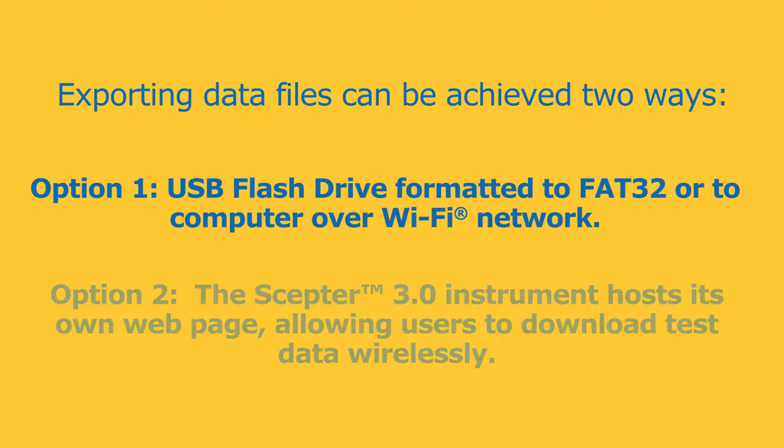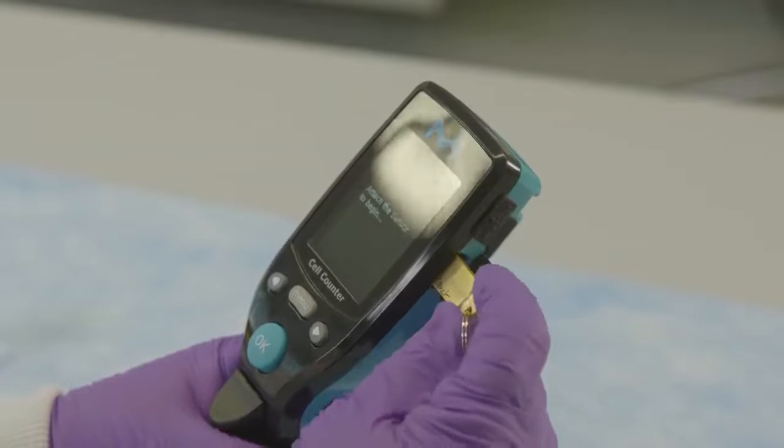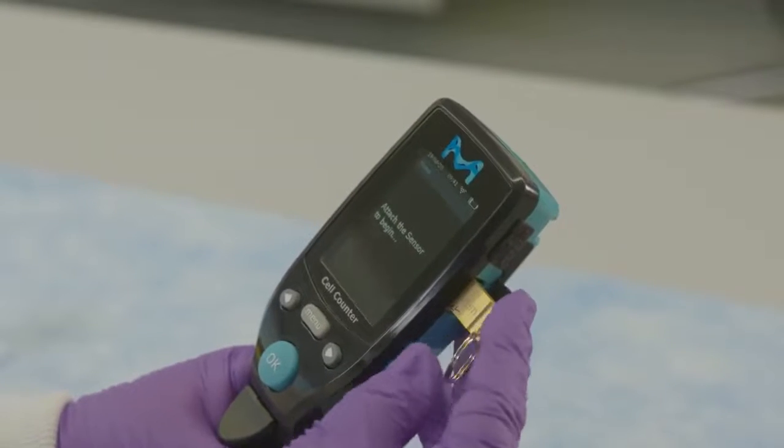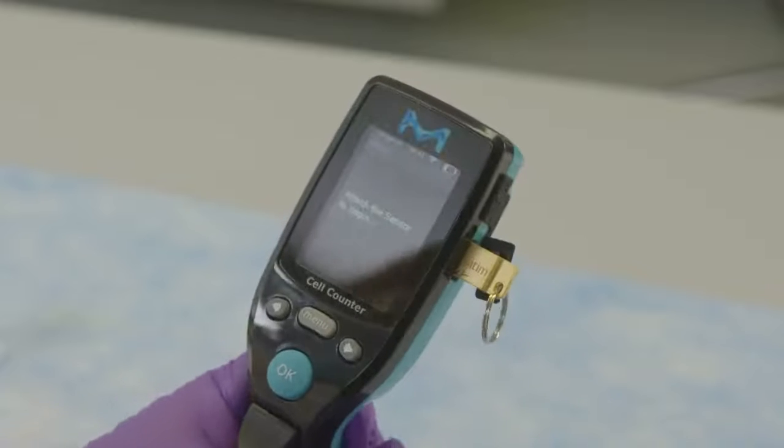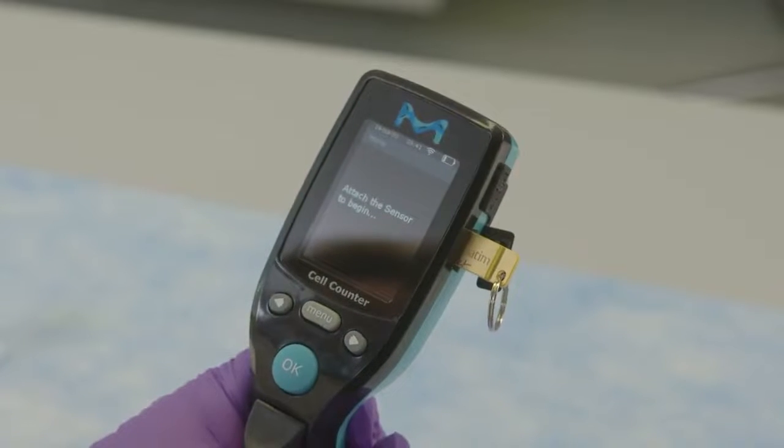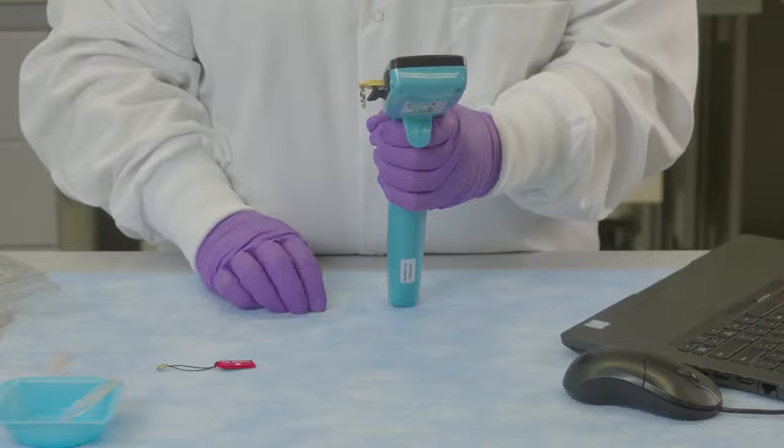The first is to use a USB flash drive that is formatted to FAT32, or to a computer over a Wi-Fi network. Insert the USB flash drive in the SEPTOR 3.0 USB port.